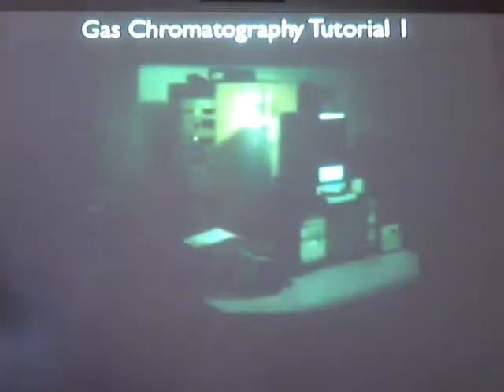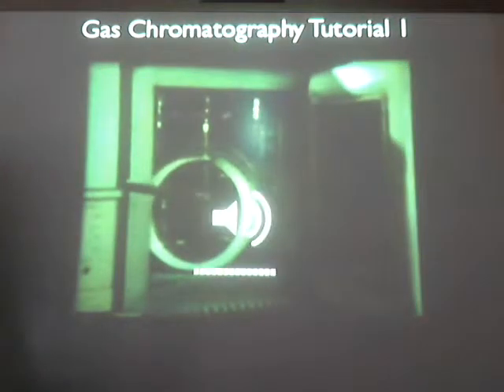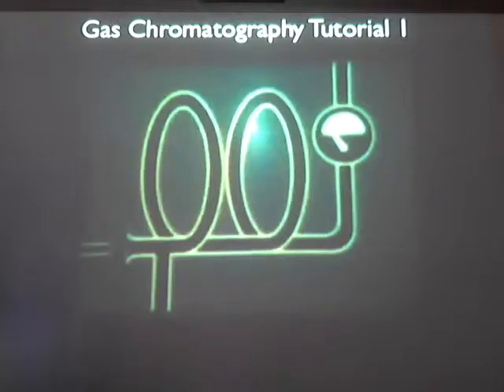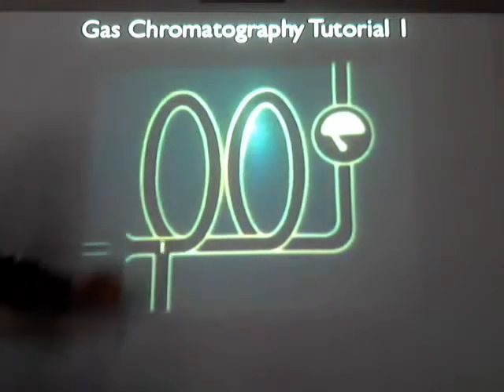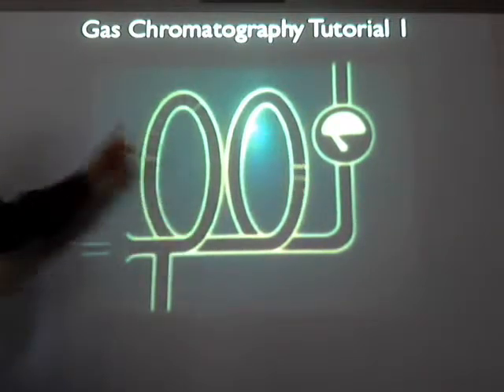Watch. It's a method of separating a mixture of compounds which can be vaporized into its various constituents. It consists, quite simply, of a very fine coiled tube, usually made of glass or stainless steel, which has a pure carrier gas flowing through it constantly and at a precisely controlled temperature. Distributed throughout the coil, you have a porous adsorbent. At one end, you inject the liquid mixture of compounds. It's vaporized immediately in the heat, and the vapor is carried by the gas through the coil.